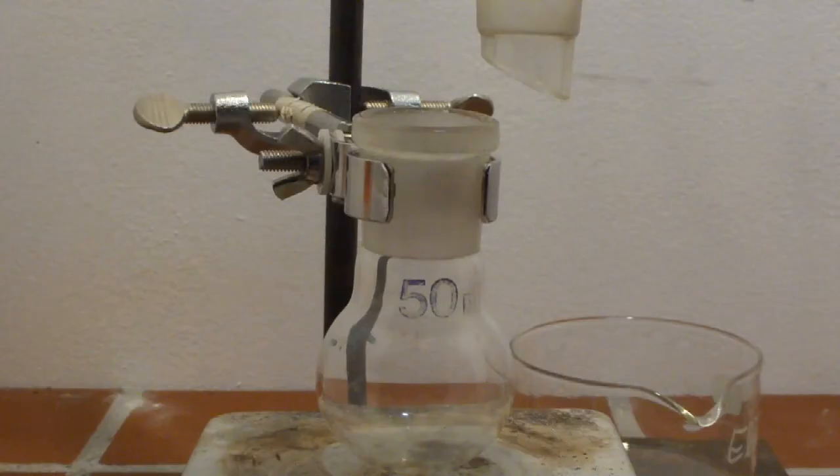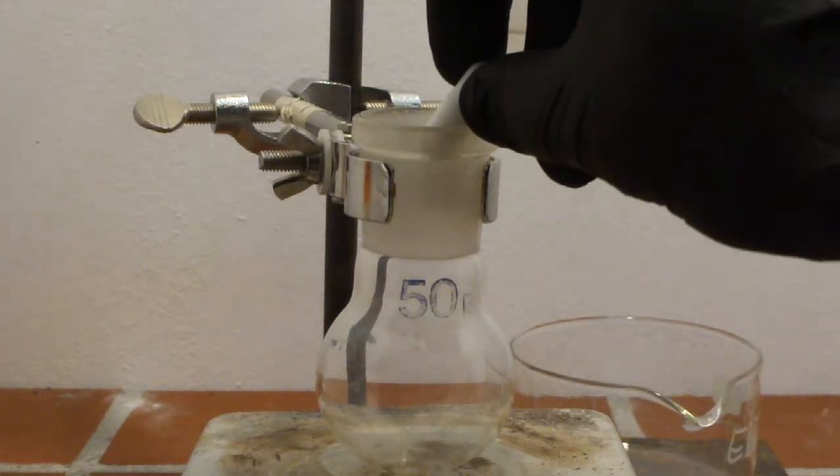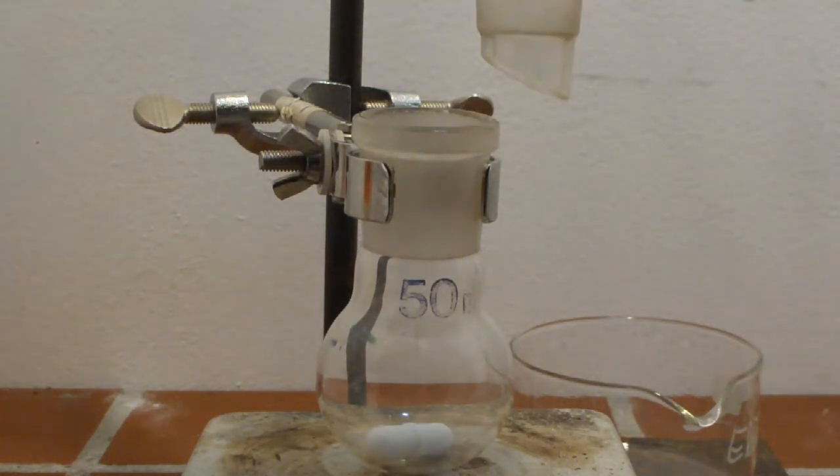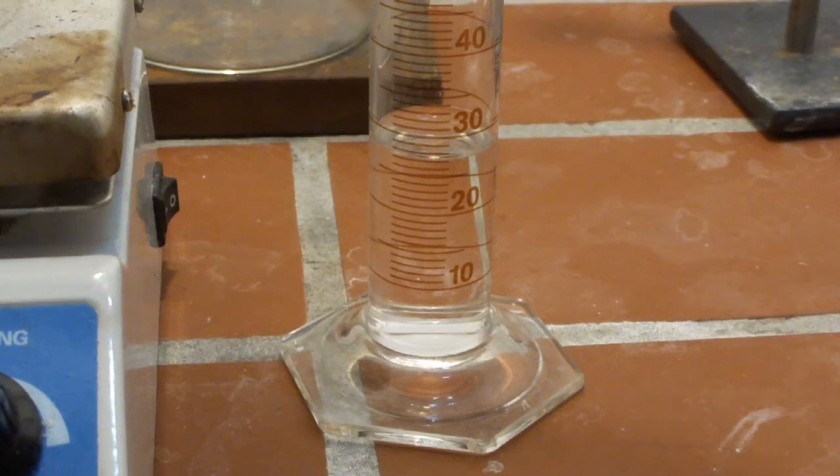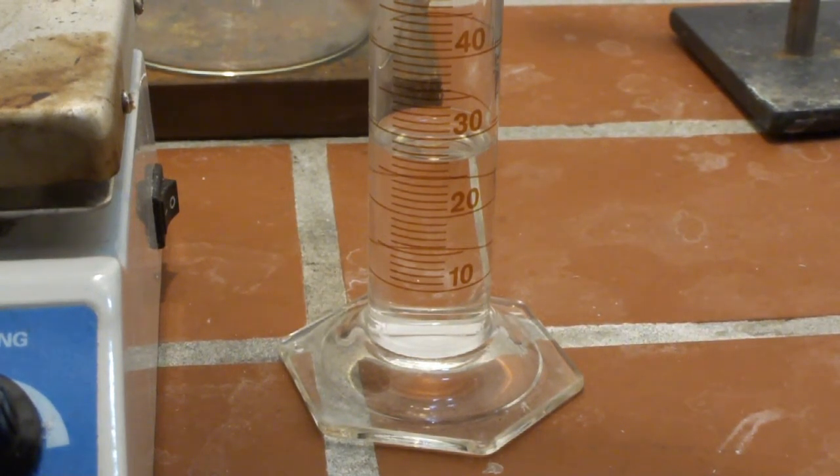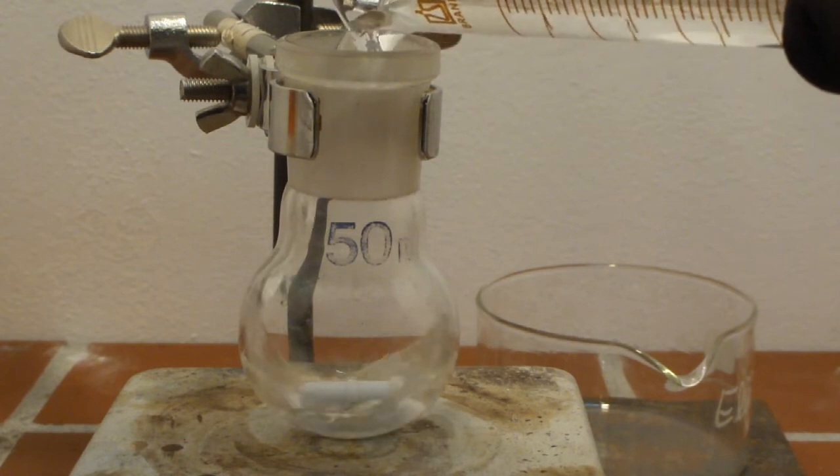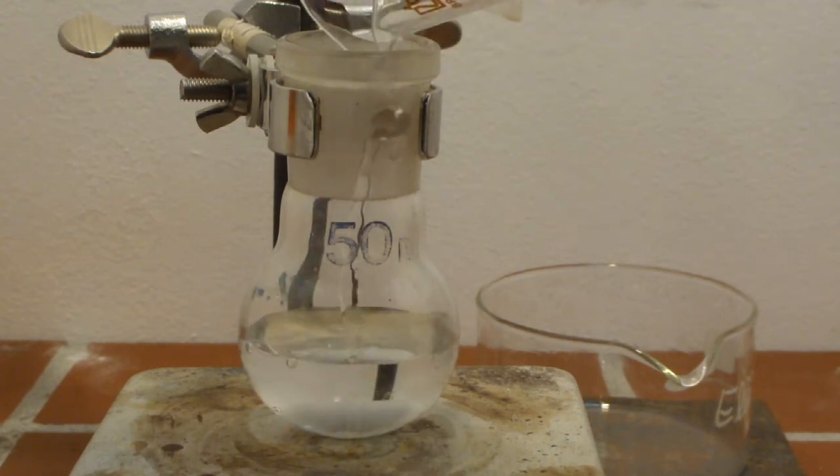Now for our reaction setup. We chose to do this small scale because at least for us, the p-toluene sulfonic acid is more useful than toluene. However, if you want toluene, you can of course scale this up. In our case, we went with a 50ml round bottom flask equipped with a magnetic stir bar. To this, we added 25ml of distilled water, followed by 2.5ml of concentrated sulfuric acid while stirring.